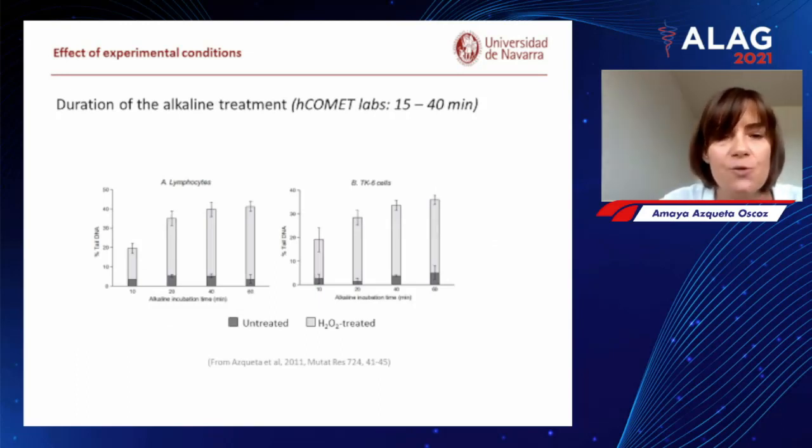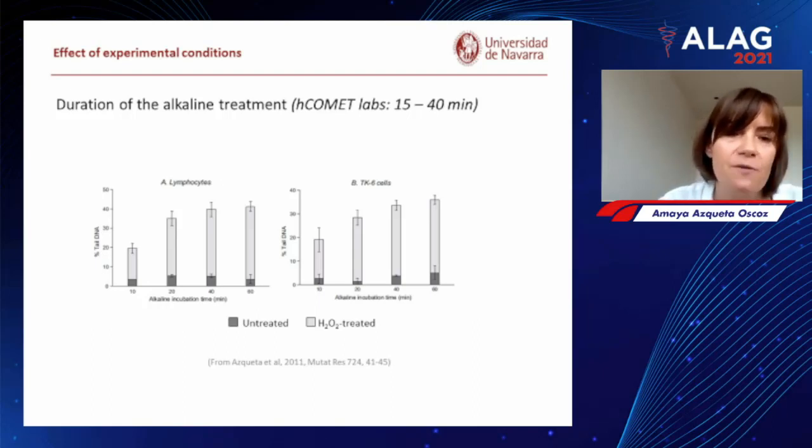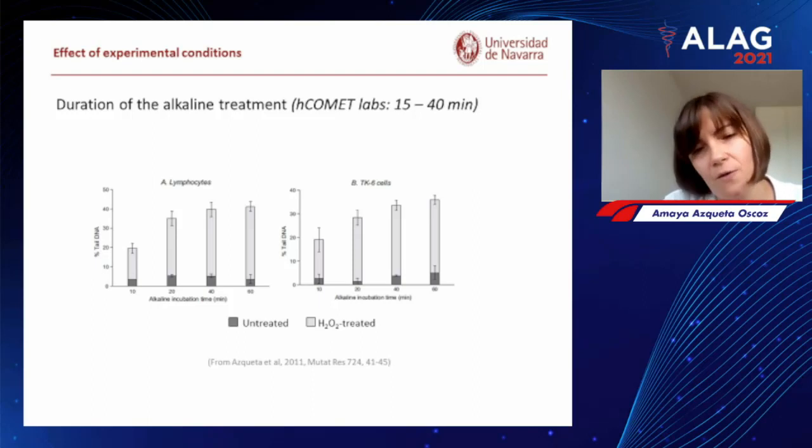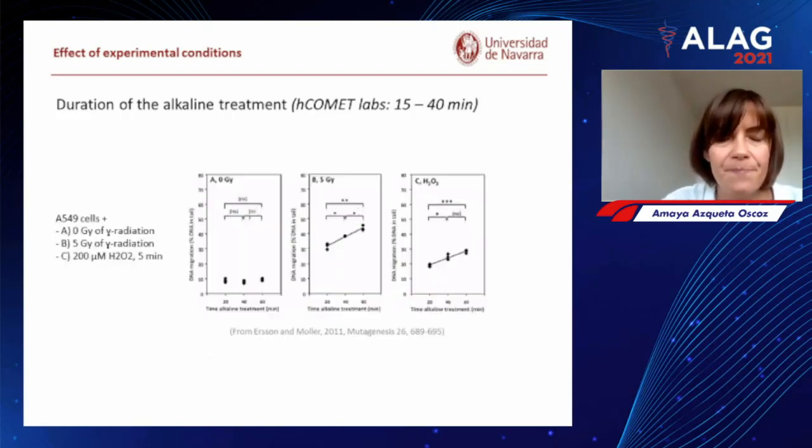Regarding the duration of the alkaline treatment, here we have results obtained after analyzing untreated and H2O2 treated lymphocytes and TK6 cells using different times of alkaline incubation from 10 minutes to 60 minutes. And as you can see, there is no effect on the untreated cells, or at least the effect is not very clear, but it's a clear effect in the treated ones. And the same results were obtained when using A549 cells.